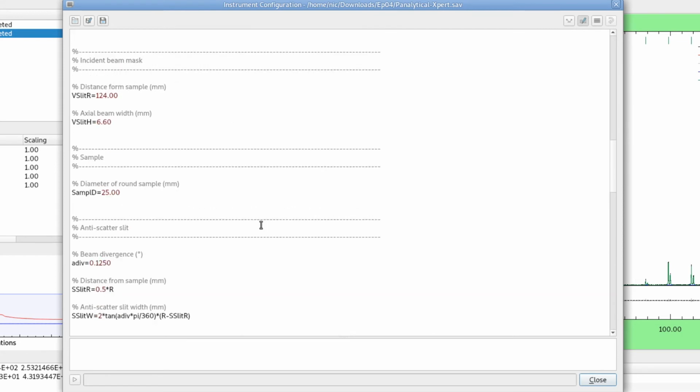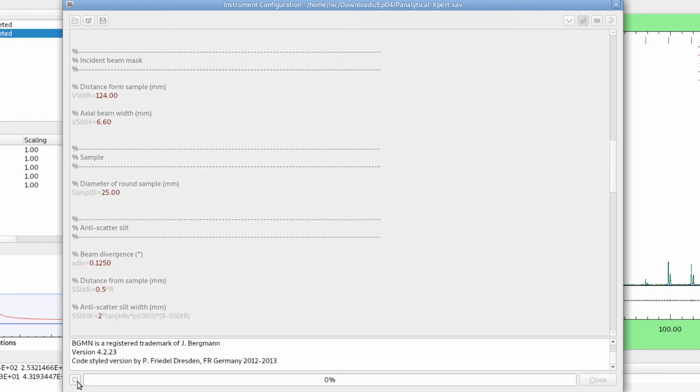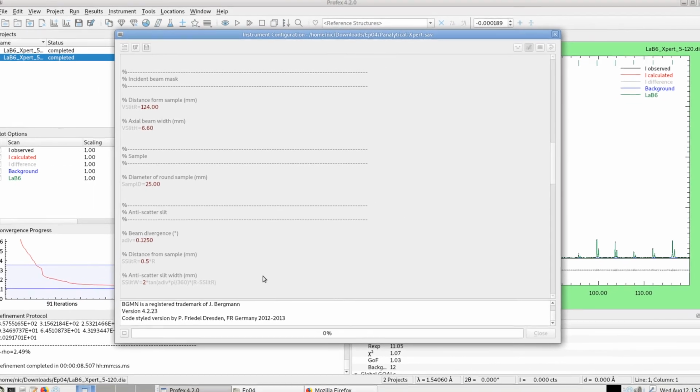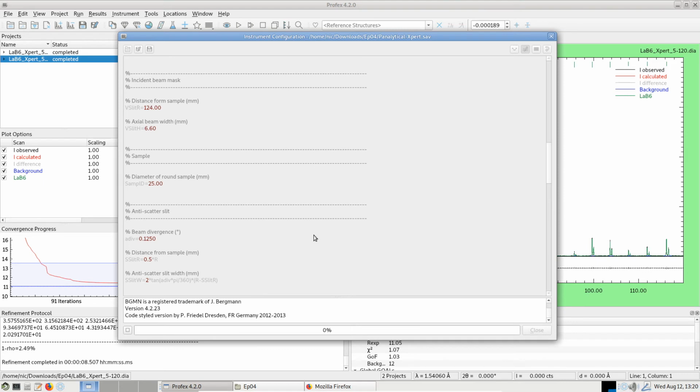And we have to stay in the text editor and run the calculation from here. So now this file will not be modified anymore. Whatever we change here will be used for the calculations. And now the computation of the profile shape started. And this is a very slow process. It will take a few minutes to complete. So we will fast forward.